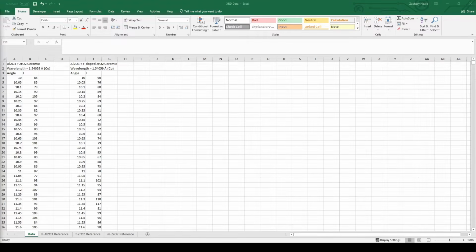In this video, I will show you how to graph XRD data using Microsoft Excel. So in this sheet, we have two sets of data. First is aluminum oxide and zirconium oxide ceramic. And the second set is aluminum oxide with yttrium doped zirconium oxide ceramic.